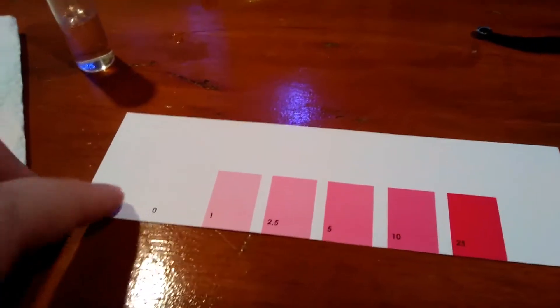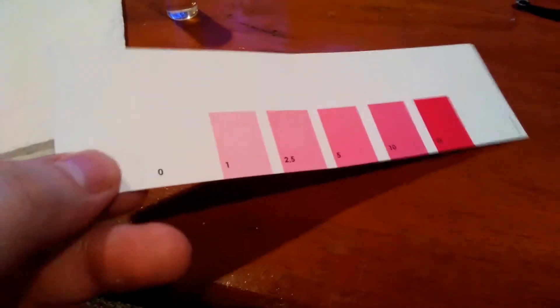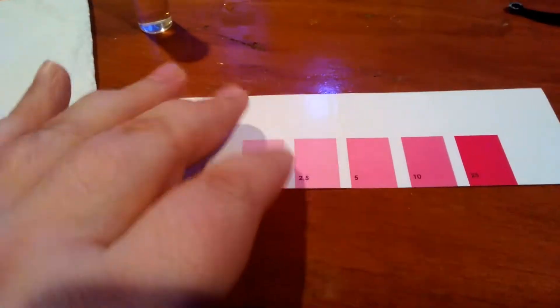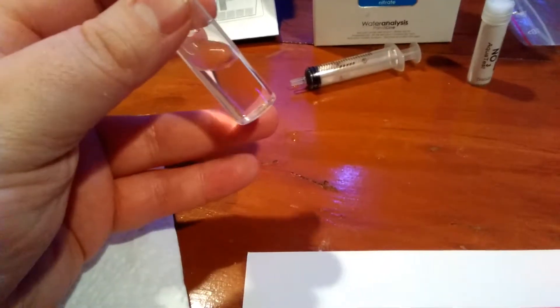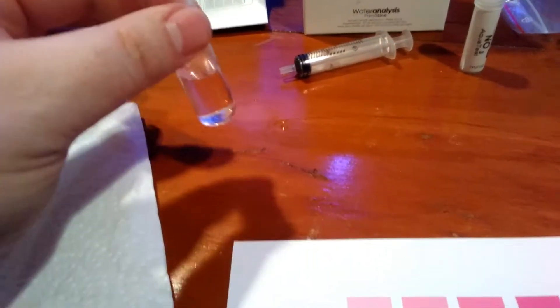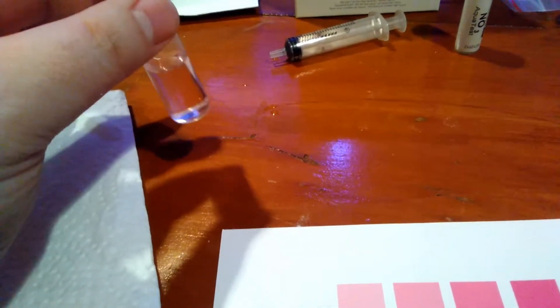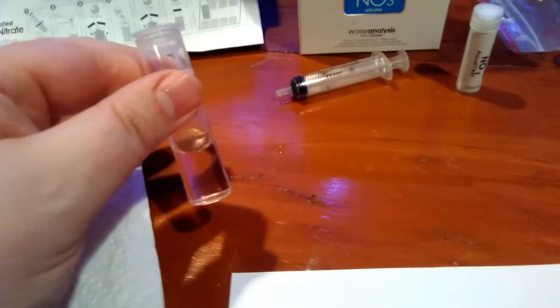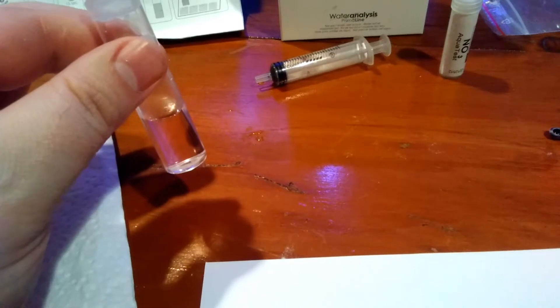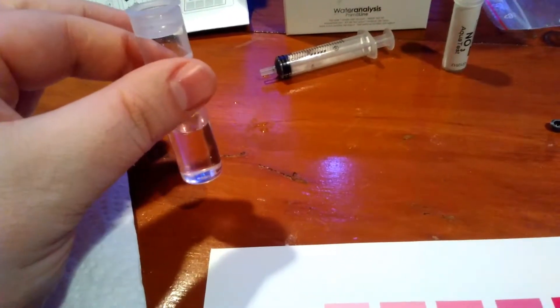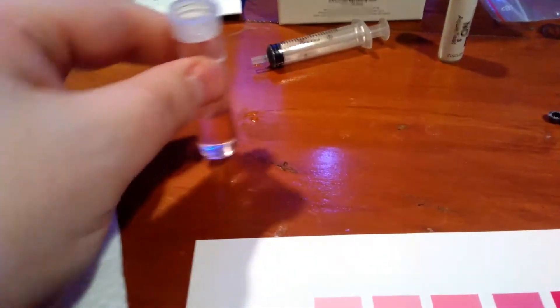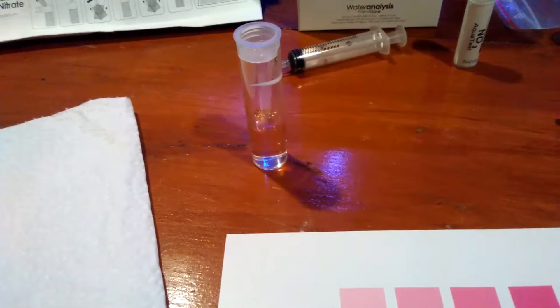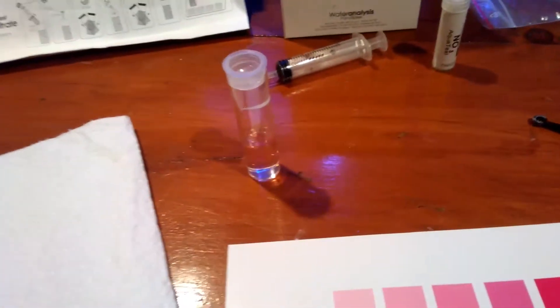One thing I want to talk about is this card stock. It's actually very paper thin and could get ruined very easily with water that may be sitting at the bottom of your test tube right here because you actually want to rinse this out. Rinse it out three times with tap water or RODI water if you prefer, and then stick it in your tank and rinse it out three times with your tank water and then fill it with the syringe. That's the best way to do it. That's what they tell you to do. Why not just do it right?